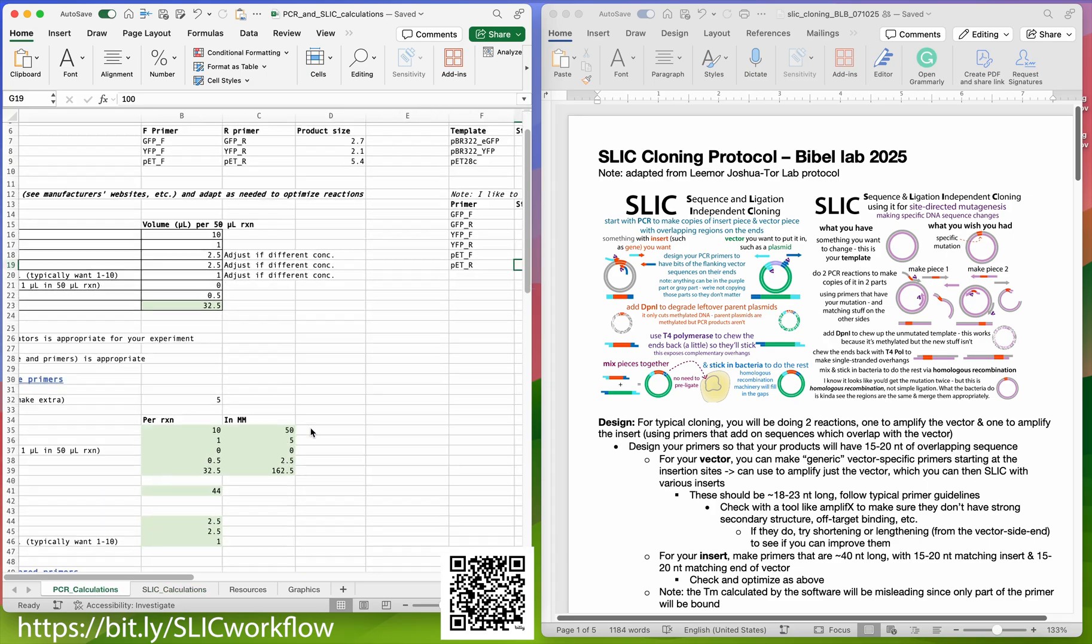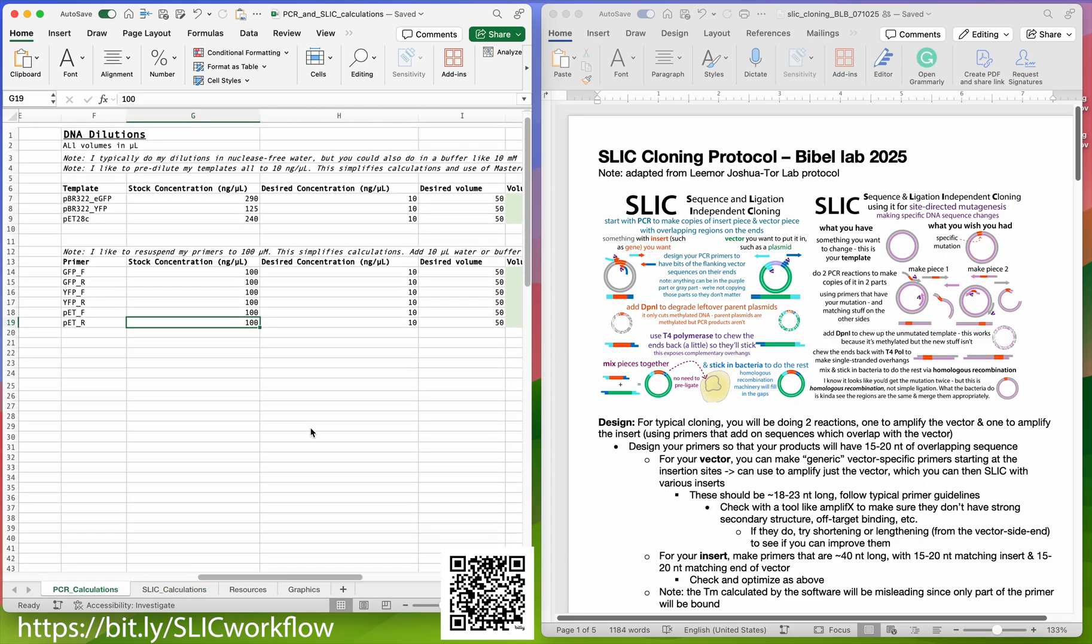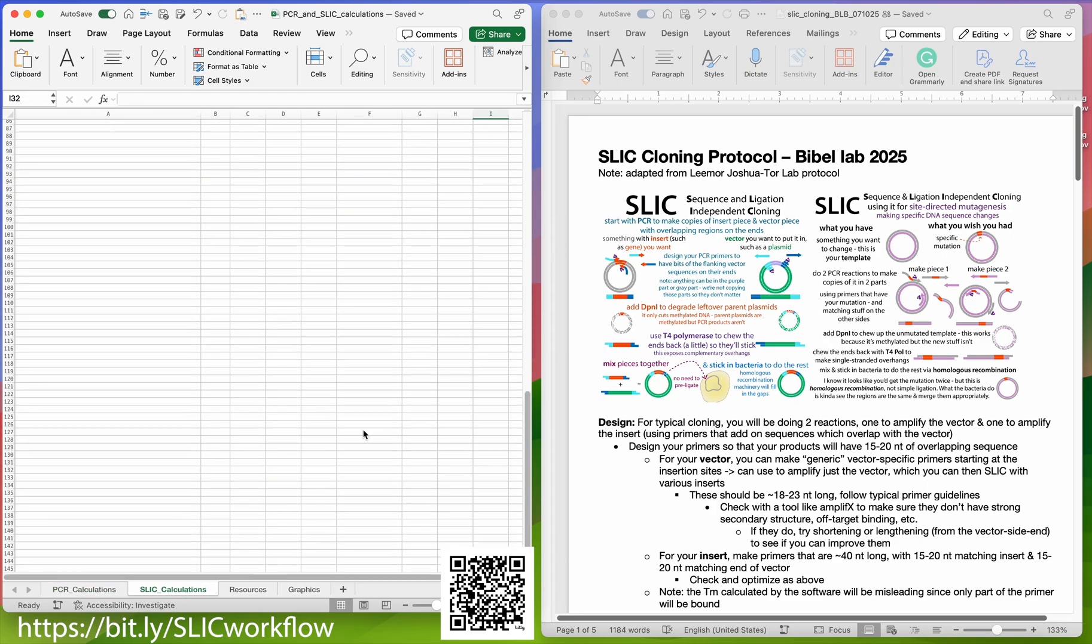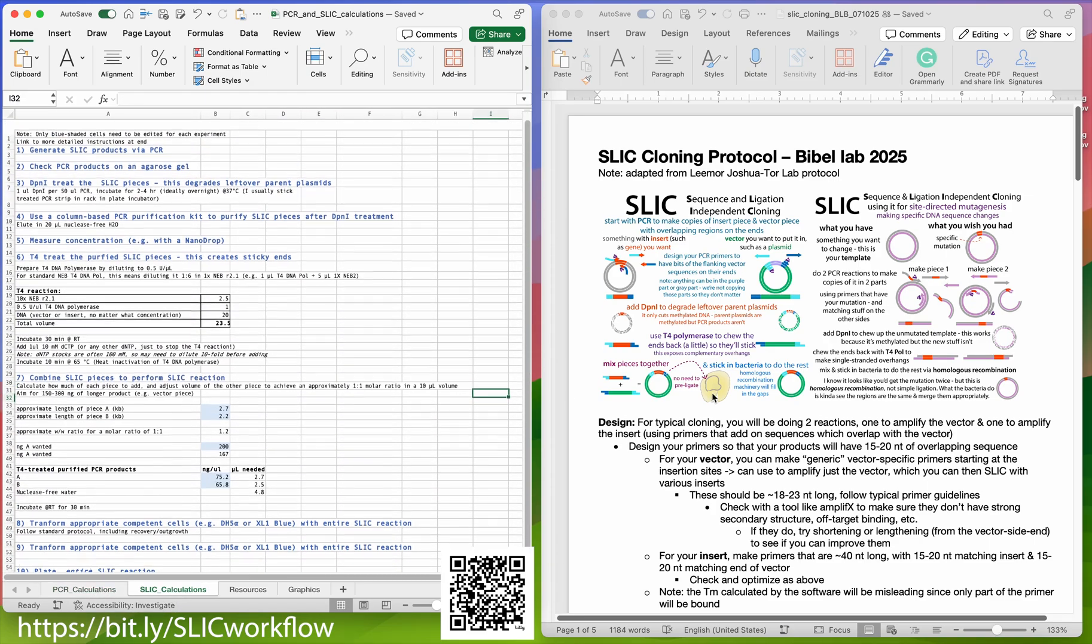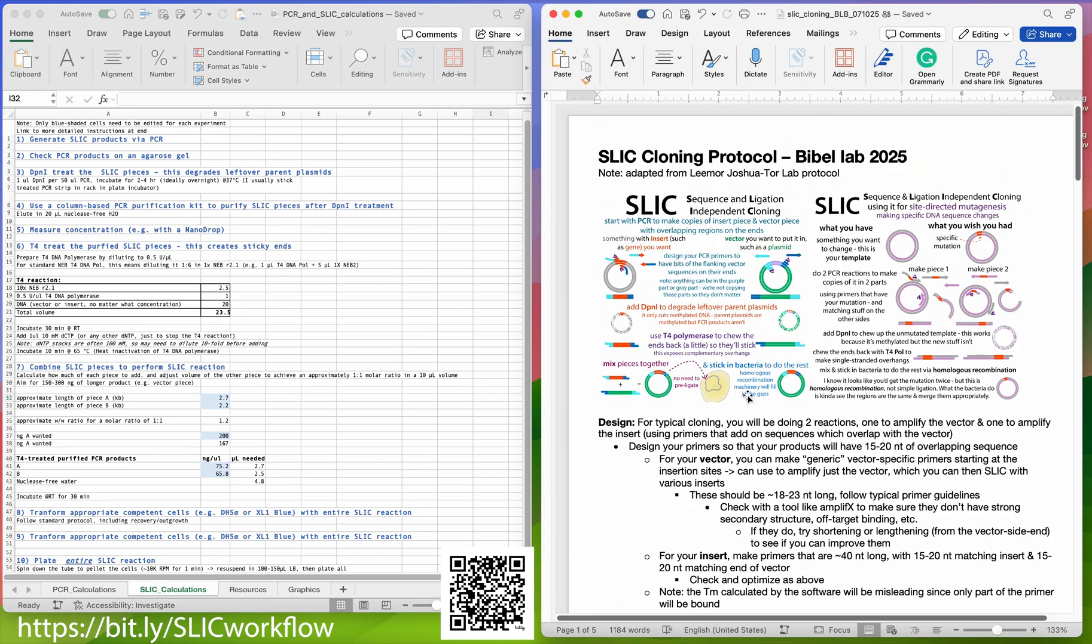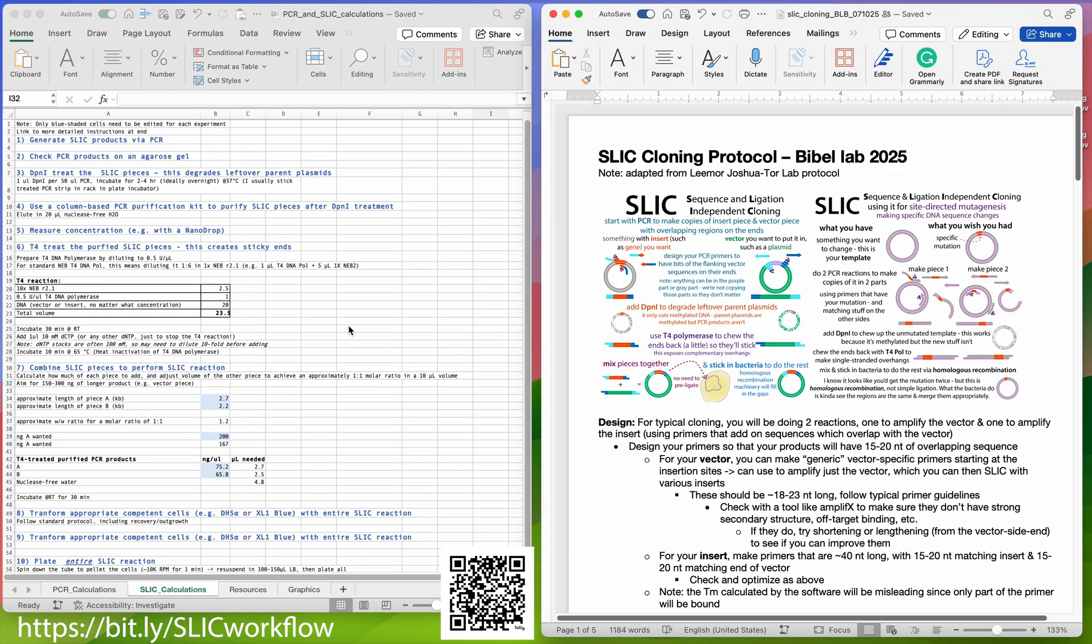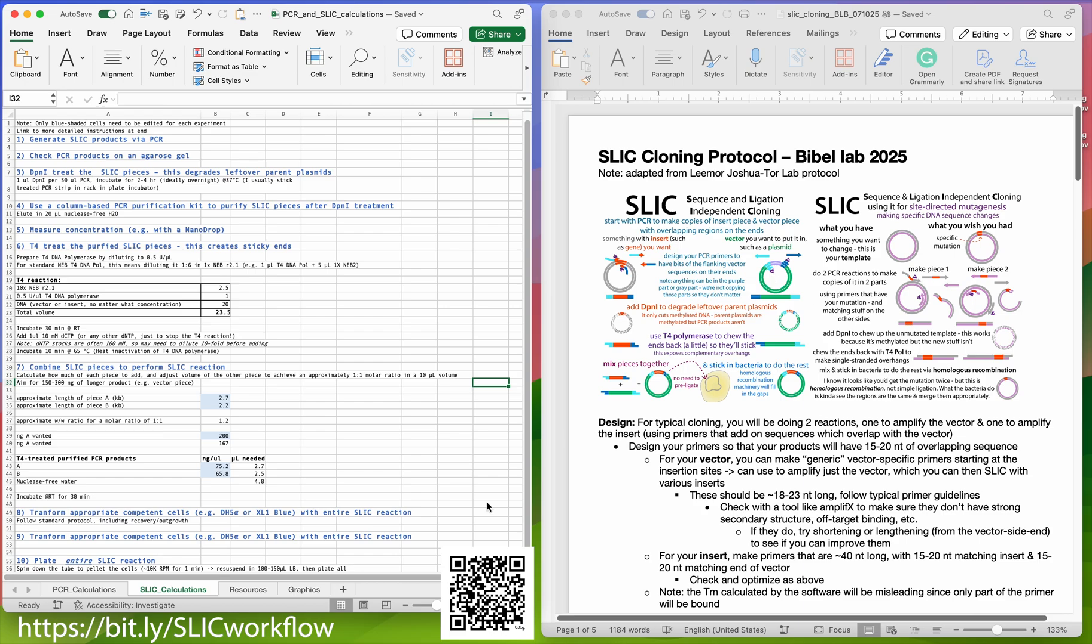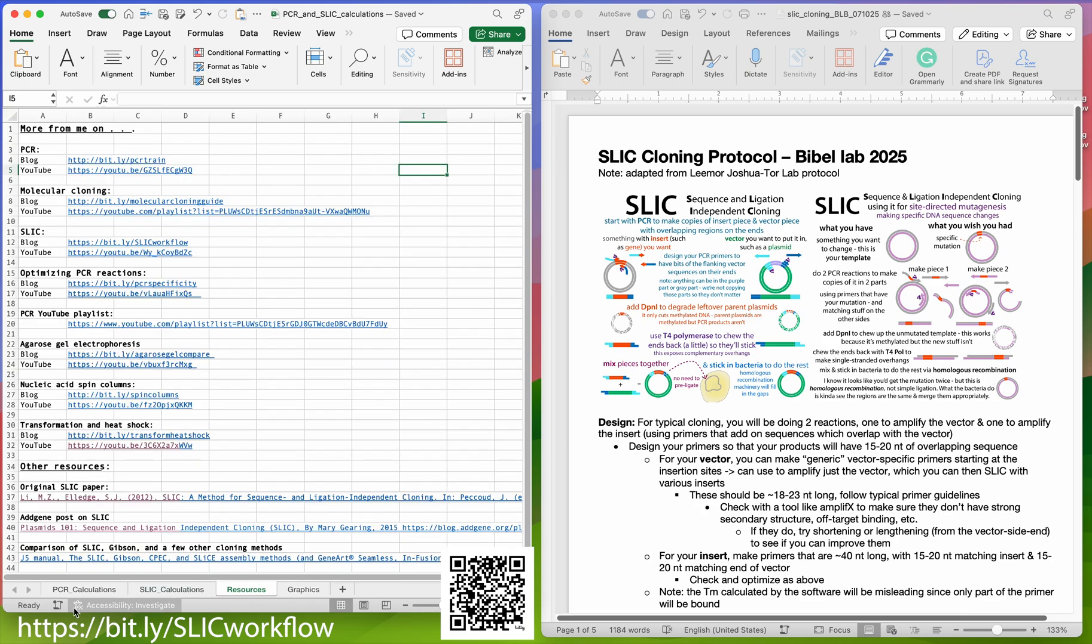I wanted to share a spreadsheet as well as a written protocol that I have for doing SLIC, sequence and ligation independent cloning. It's this type of molecular cloning where you use PCR to make copies of pieces, and then you basically have the cells put the pieces together.